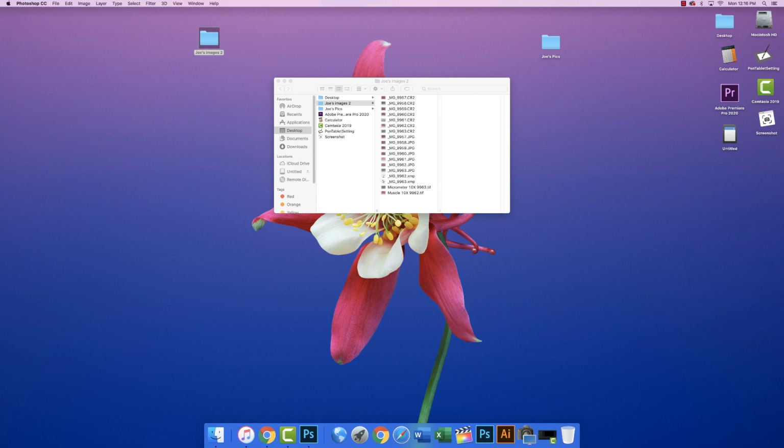Of course, if I want to make a scale bar on my 20x or my 40x or 5x or 100x objectives, then I need to take a photograph of the micrometer using those different objectives and use those images to draw the scale bar on images that were collected using the same magnification objective. There you go, pretty simple.